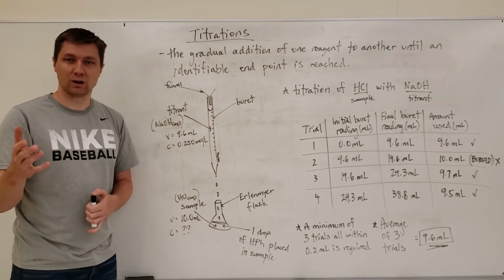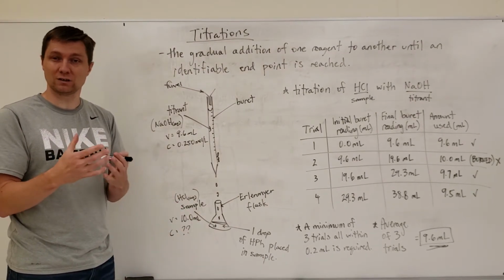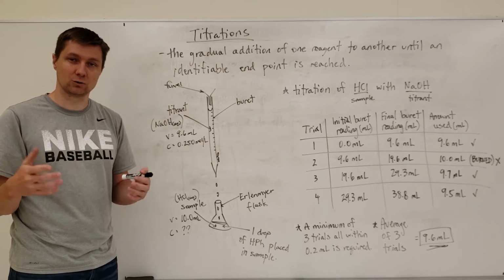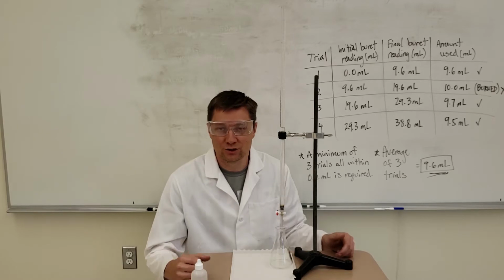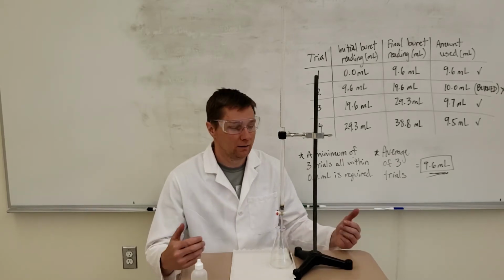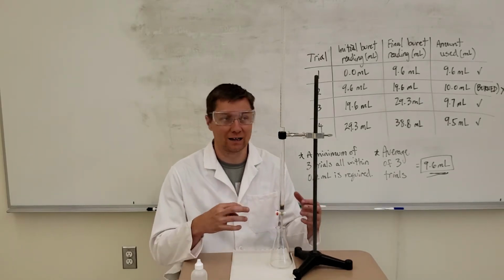And so in the next couple of clips, I'm going to demo for you what this titration really looks like using the actual equipment, and then we'll look at some titration curves as well. Okay, so just a short demo for you guys on a titration, what it looks like exactly with the apparatus.